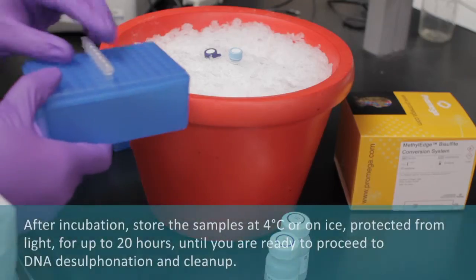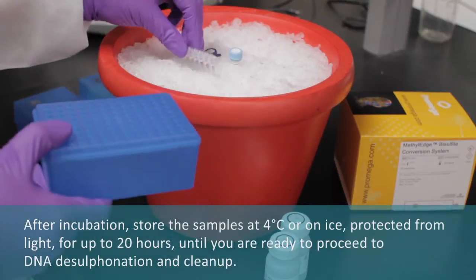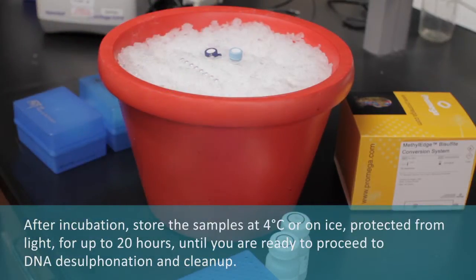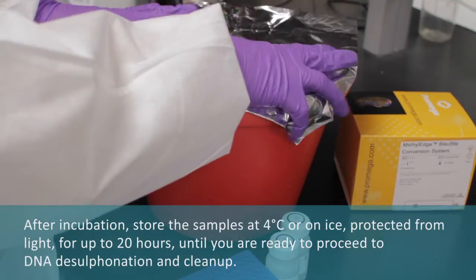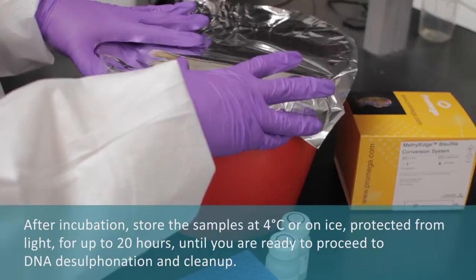After incubation, store the samples at 4 degrees Celsius or on ice, protected from light, for up to 20 hours until you're ready to proceed to DNA desulfonation and cleanup.